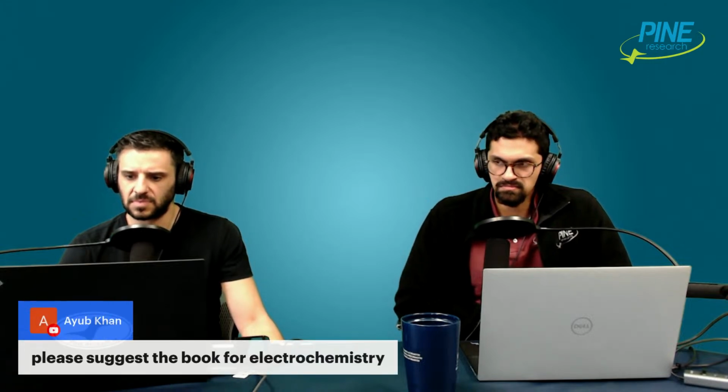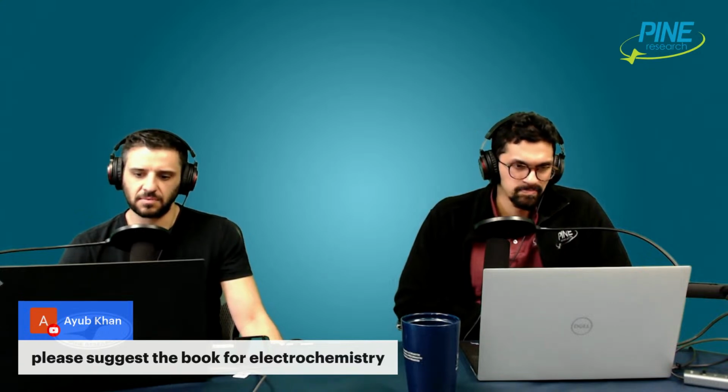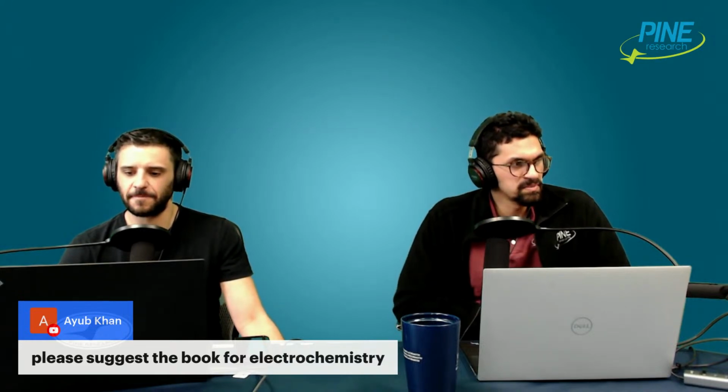I think that's it. That's all we can really do. Well, a book for electrochemistry: Bard and Faulkner. Yeah, Electrochemical Methods. The famous Bard and Faulkner book. Fundamentals and applications.